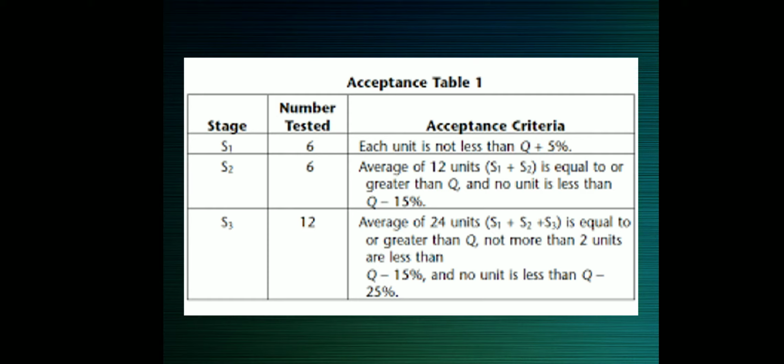So what is Q? Q is the amount of drug to be released at a particular time, because we take the samples at particular times and then we analyze. So the calculation is such that at a particular time, how much quantity of drug is released in the dissolution fluid. Based on that, which is called Q, the test is accepted or rejected.